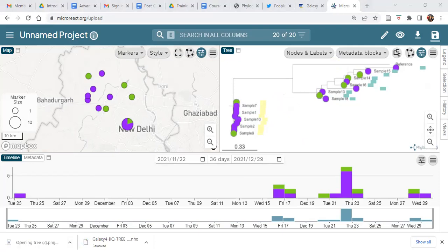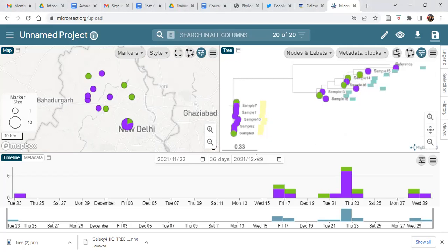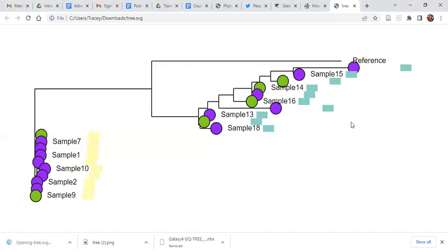You can click on the save button and download your file as a PNG or SVG file, whichever you prefer. You can see that it does create quite a good resolution of the tree for you.